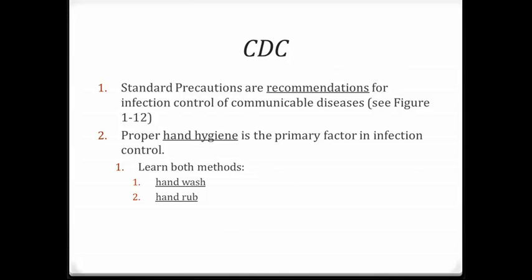The CDC, Centers for Disease Control, is responsible for developing standard precautions — recommendations for infection control of communicable diseases. You can also see figure 112 in your book for more details. The CDC also comes up with recommendations on proper hand washing procedures, which is a primary factor in infection control. There are a couple of ways of hand hygiene: proper hand washing and the use of proper hand rubs.